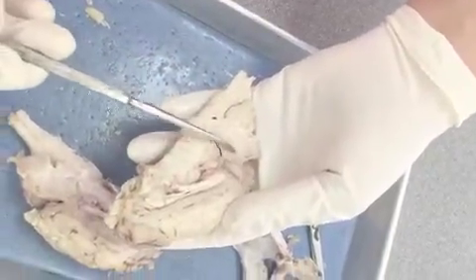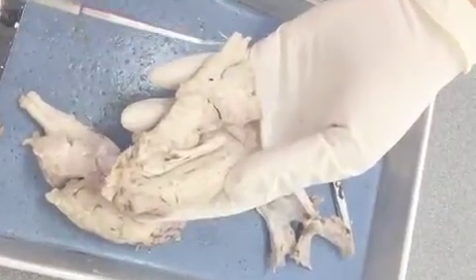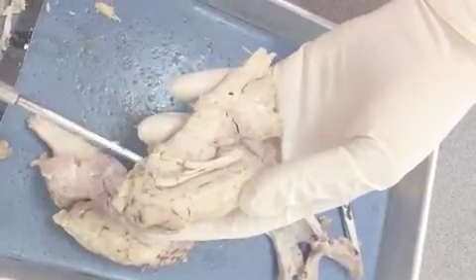Right here is the cerebellum, which controls balance and coordination. It's very tree-like. This white portion here is the corpus callosum, which just connects the two hemispheres together.